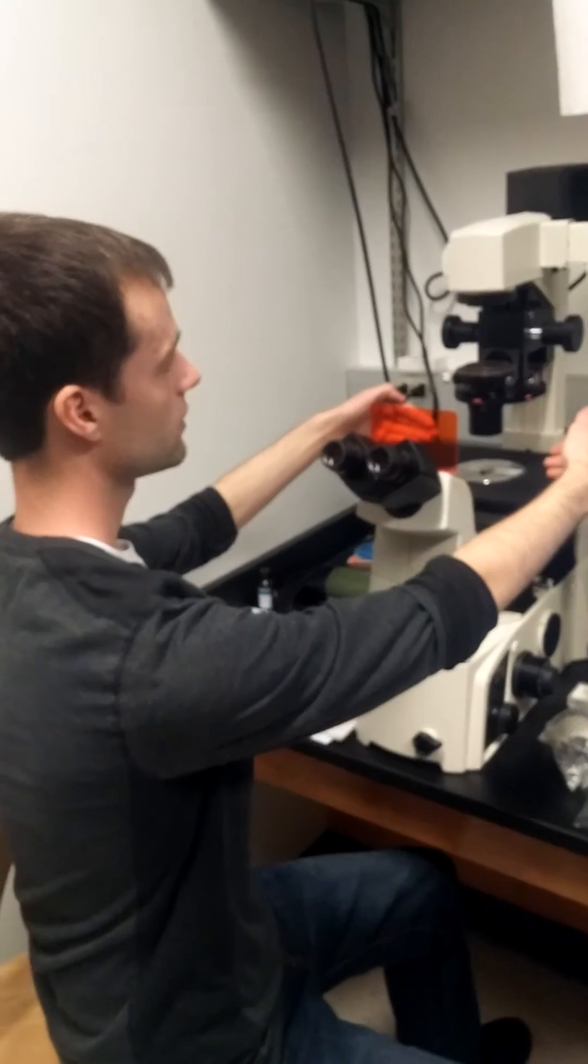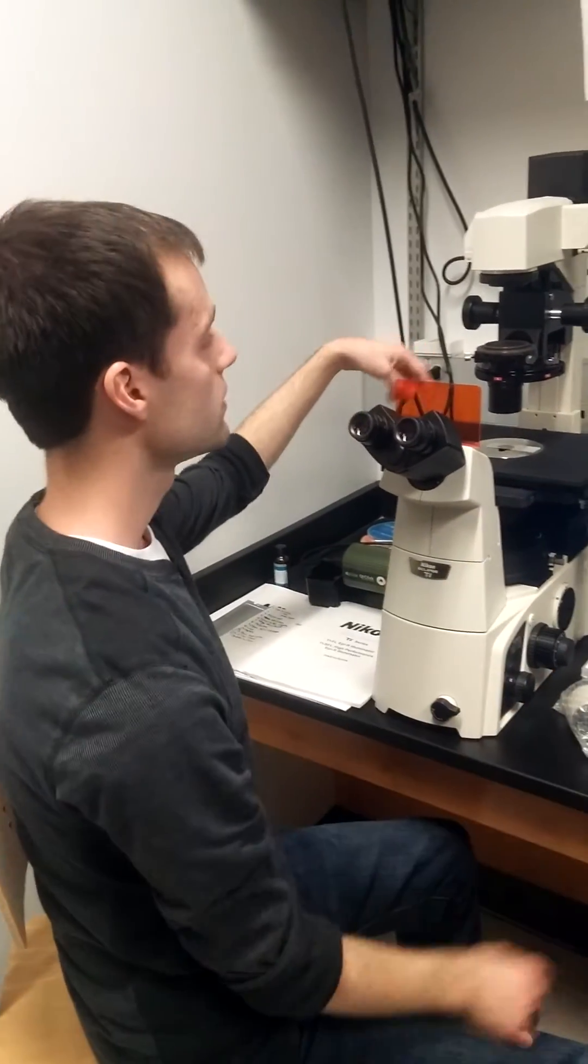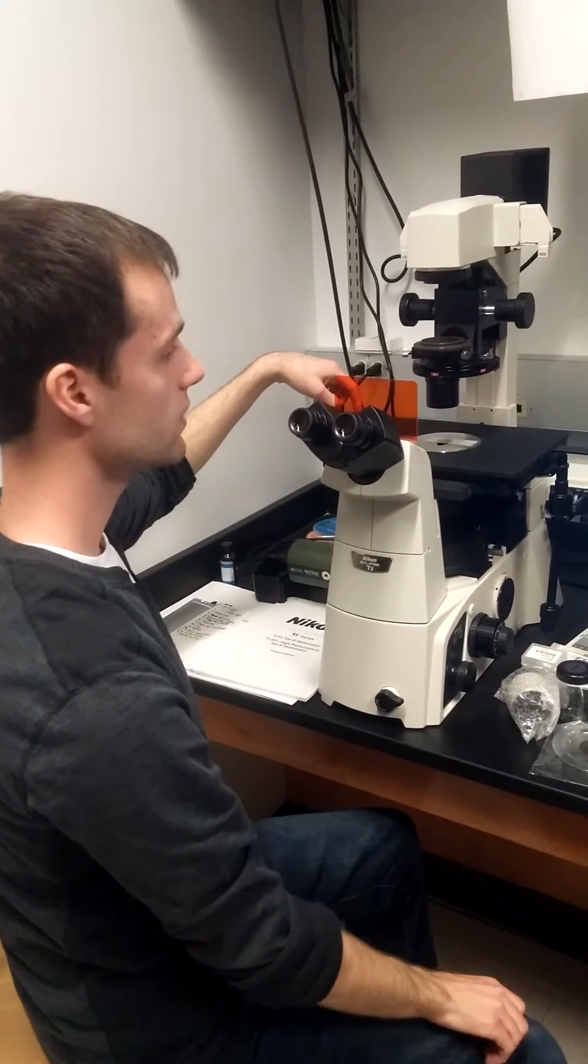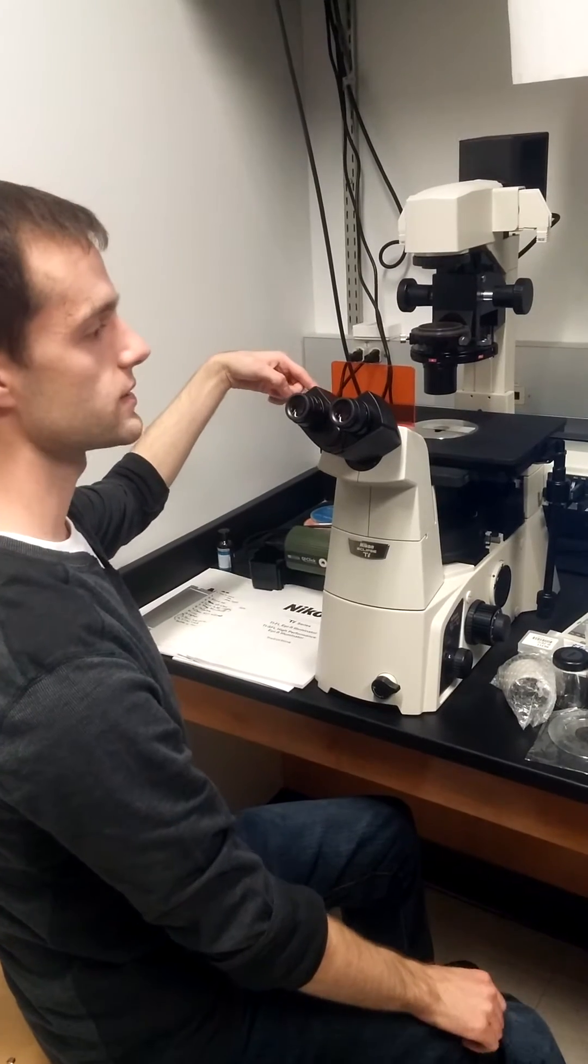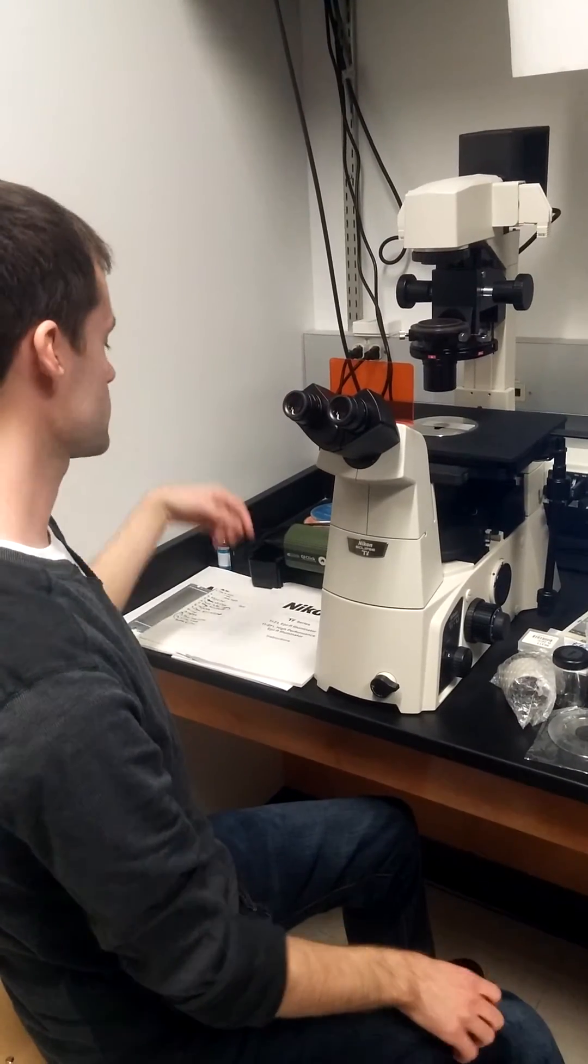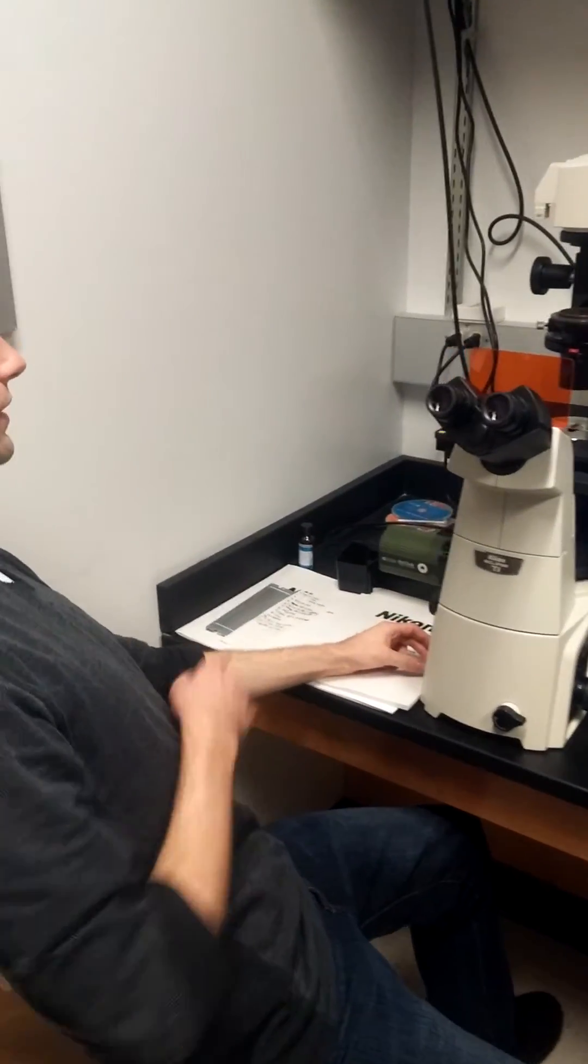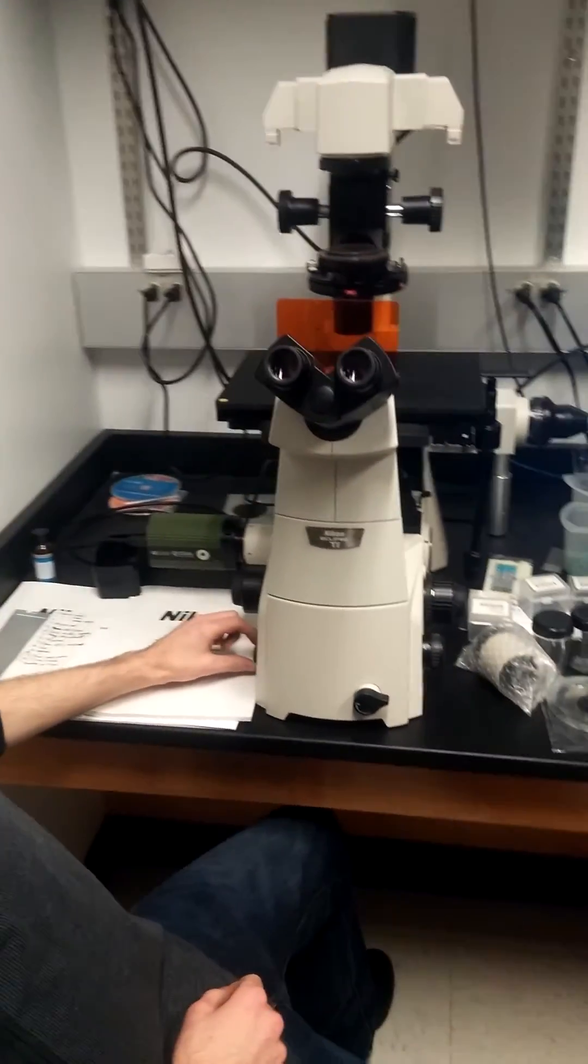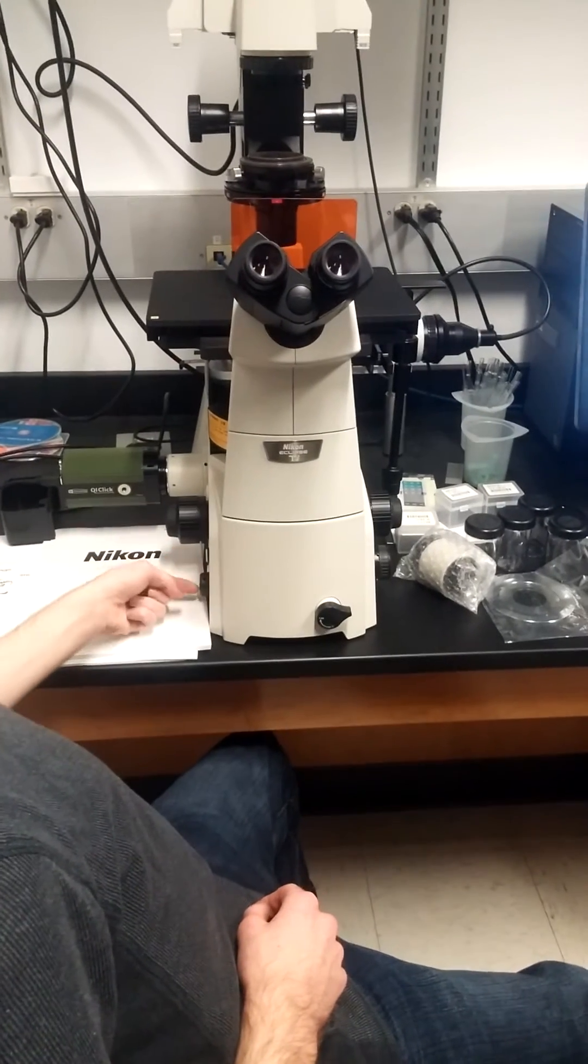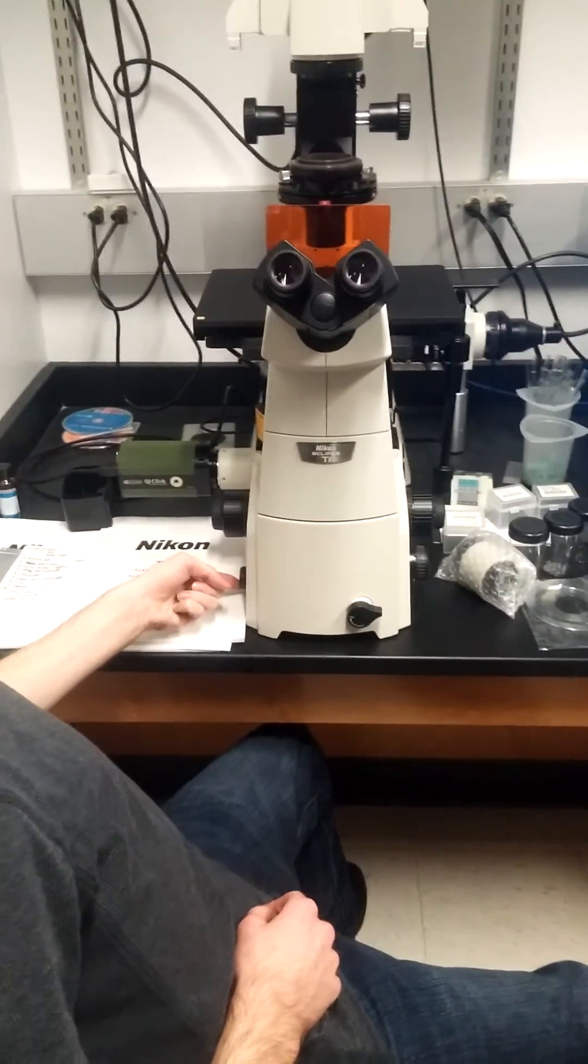Right now I'm just running regular light through this microscope. To turn on the fluorescence, if we want to take a fluorescence image, we're going to turn down the brightness of the regular light by turning down the dial on the left-hand side under the power button.